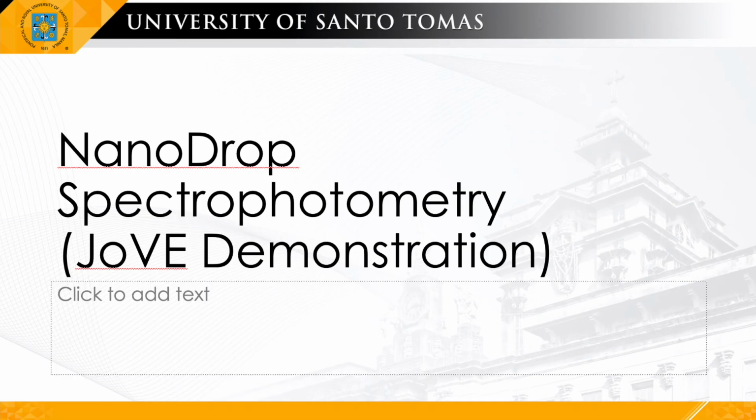The next thing that we're going to do is watch the demonstration on NanoDrop spectrophotometry. We've uploaded the videos related to this in Blackboard. So class, please watch and then finalize the related exercises. So that's about it for RNA isolation in the laboratory. Thank you.